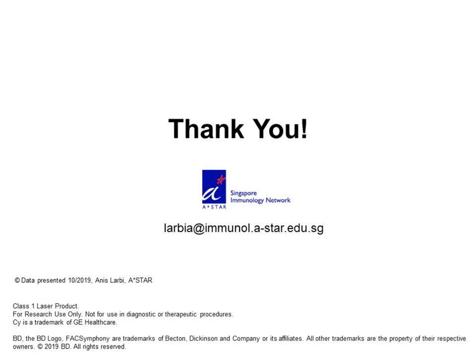Yeah, so actually the drop-in cheat sheet that I showed you is the result of the experience we have combining the fluorochromes and the markers that are either highly expressed. So we use the CD4 and CD127 as a model here. The cheat sheet summarizes which fluorochrome you can use with a low expressed marker, that's CD127, and which one can be used with a highly expressed marker. So yes, obviously it's a combination of staining index and antigen density.